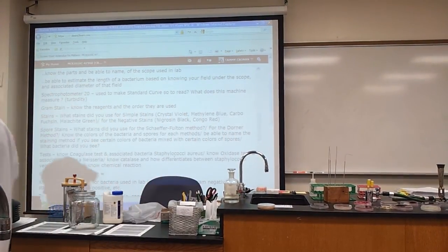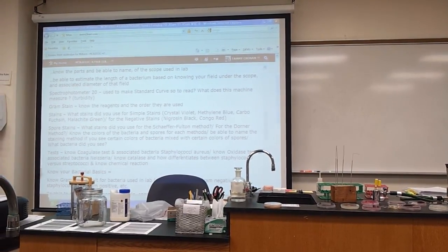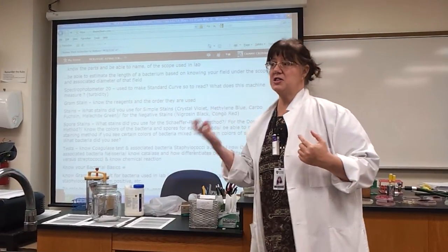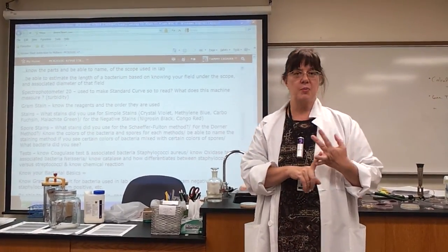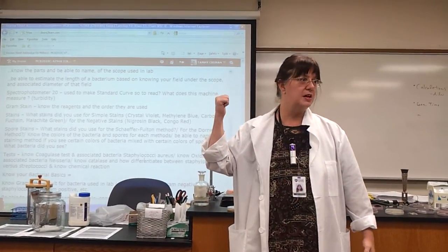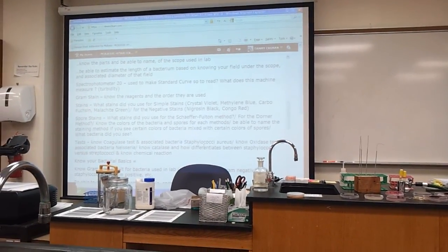Remember, with the graphs, you don't have to plot the graphs. But you do have to be able to recognize and label the X and Y axis according to what I'm teaching. You actually can change the axis on the graphs a little bit and go by what I'm teaching. Be able to know the standard curves we went over last time for optical density and percent transmission that were read off the spectrophotometer 20. Okay, honestly, spec 20, but don't write down spec 20.